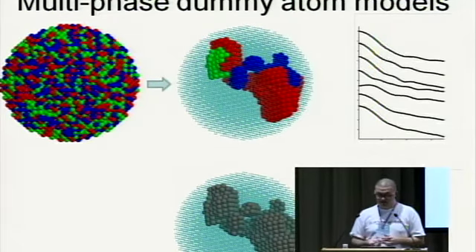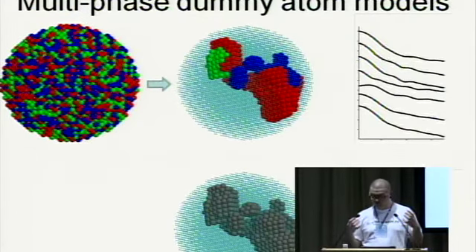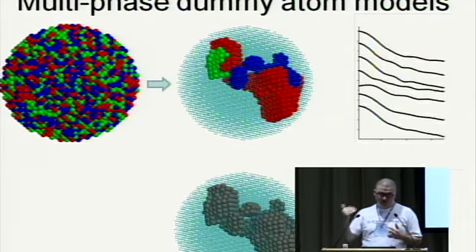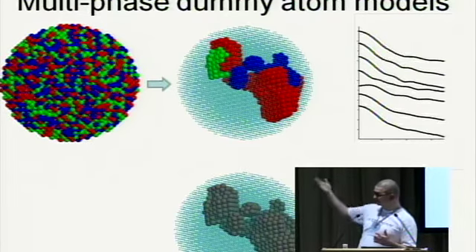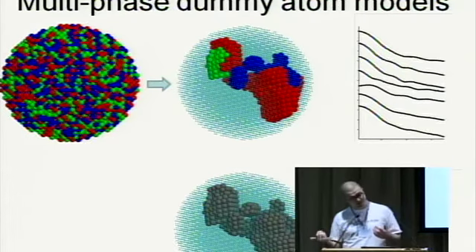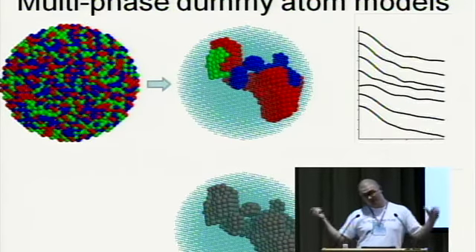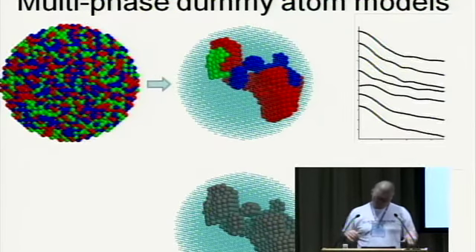So here in this case we have a complex of 3 different bodies. Let's say it's a protein-protein complex. From each individual protein we could collect the data. We could collect the data of the complex where all 3 proteins are present.